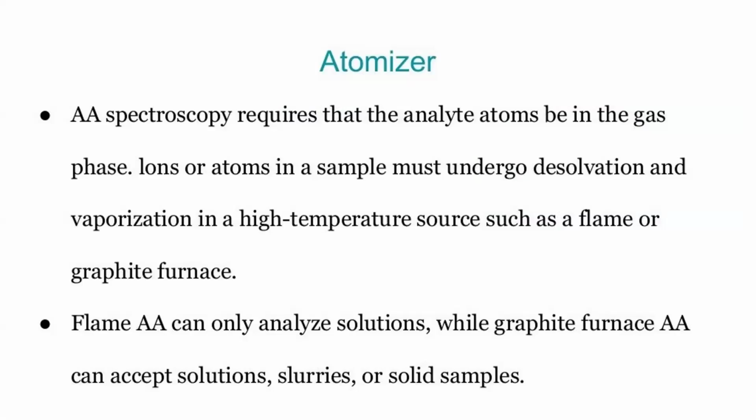Second component is atomizer. Atomic absorption spectroscopy requires analyte atoms in the gaseous phase. So how to convert the liquid sample into gaseous phase, gaseous atoms? There are some steps in the conversion of the liquid sample solution into the gaseous atoms.